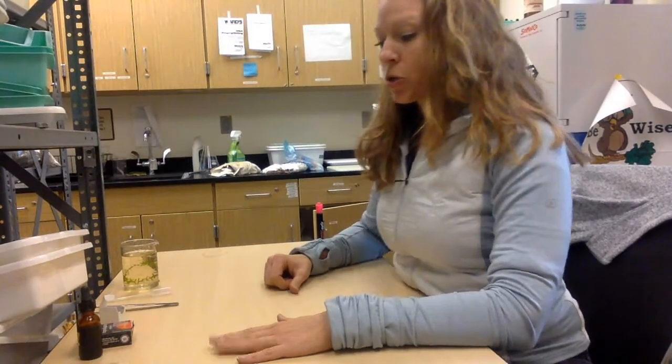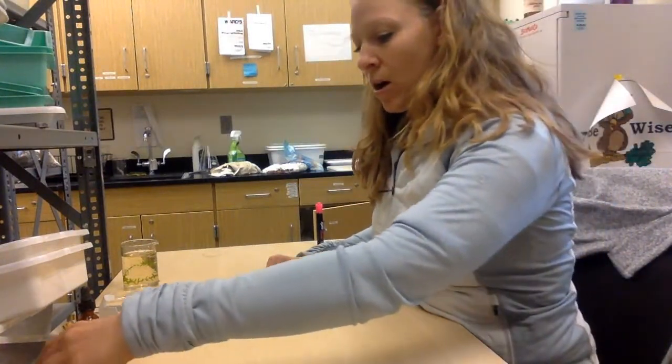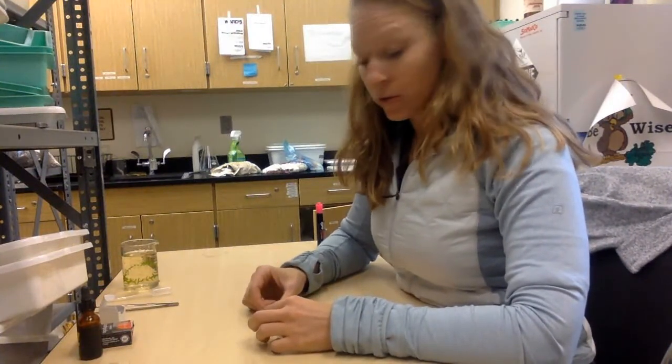Hey there, in this video we're going to be talking about how to make wet mount slides for the animal cheek cell and for the elodea leaf. So there are two different methods. Both of these are wet mounts, meaning that they are slides that we have to put a little bit of water on and a cover slip to make and to use under the microscope.